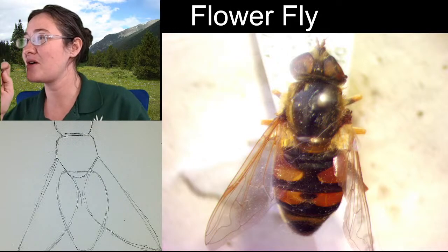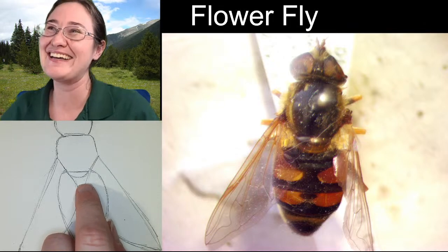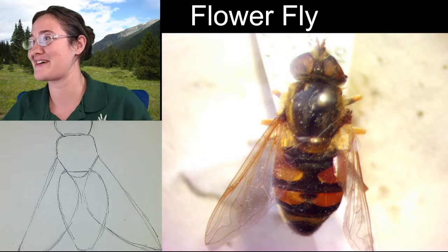The ratios are helpful to the sketch. Good. So the cummerbund is the scutellum. Yeah, exactly. The cummerbund is the scutellum. I love it.